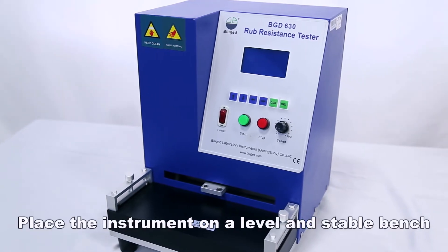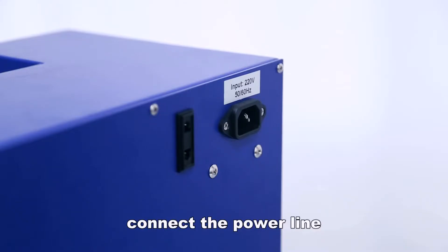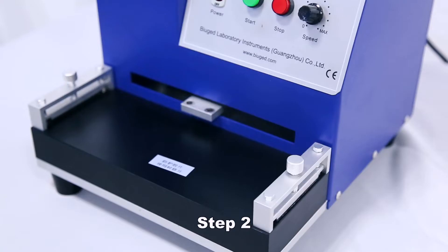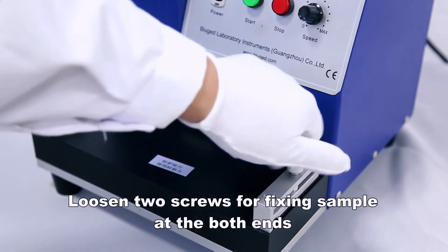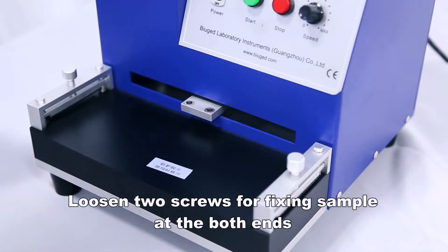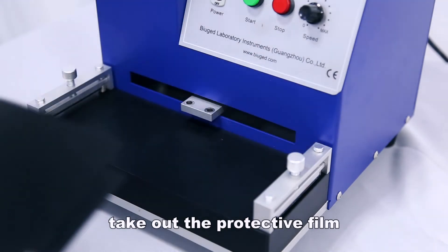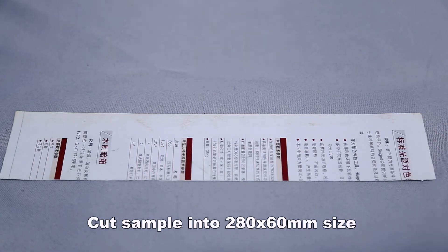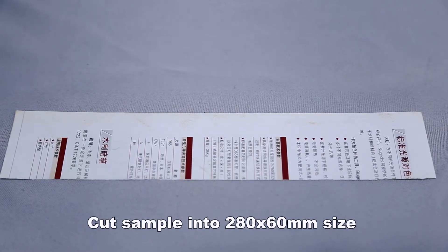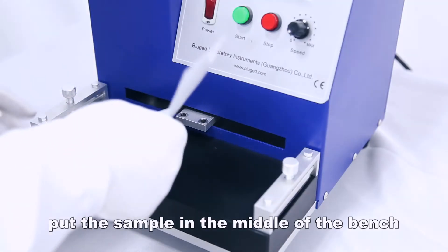Place the instrument on a level and stable bench and connect the power line. Loosen two screws for fixing the sample at both ends, take out the protective film, and cut the sample into 280 x 60 millimeters size. Put the sample in the middle of the bench.